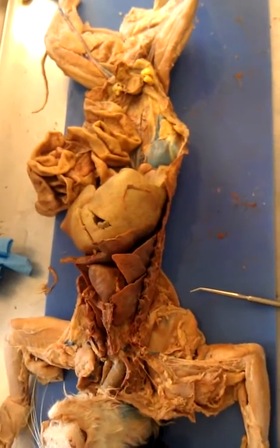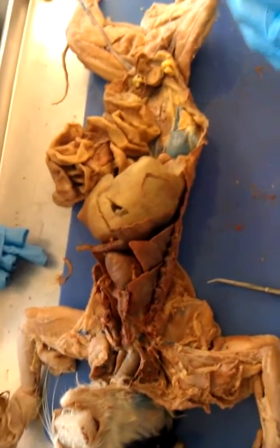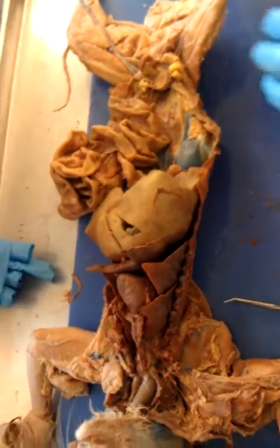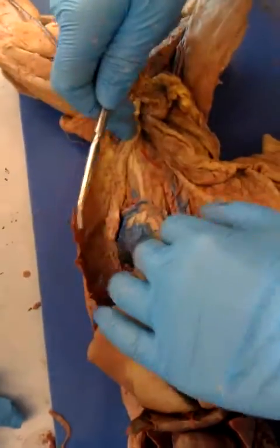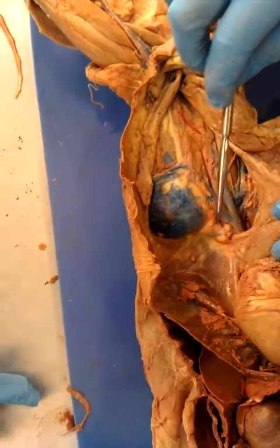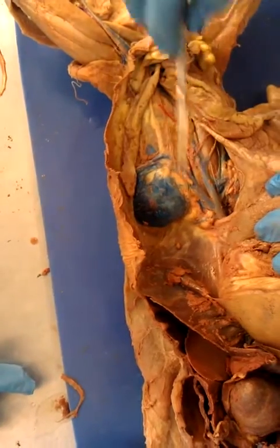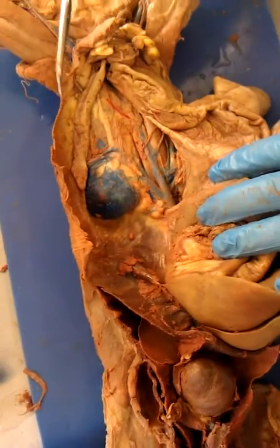Alrighty. Identification of the cat's digestive system. And go. So this is first on our list. Adrenal glands. There's the main one, and we think this is another one. We're pretty sure it goes to the other side, and there's not one that we can identify there. So that is the adrenal gland.